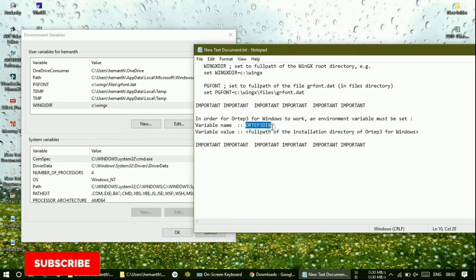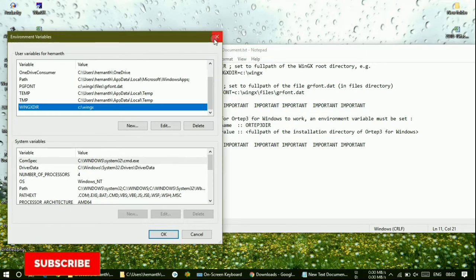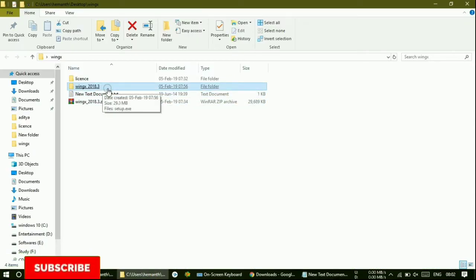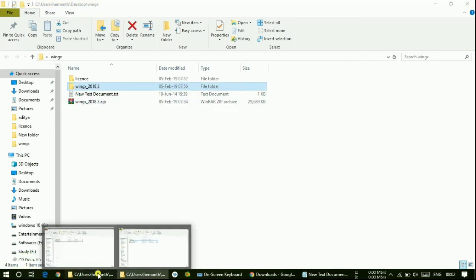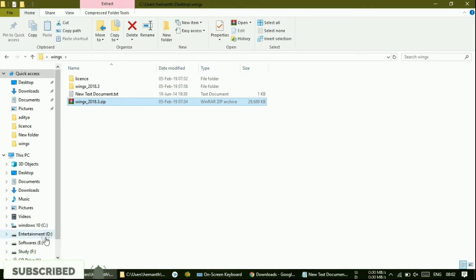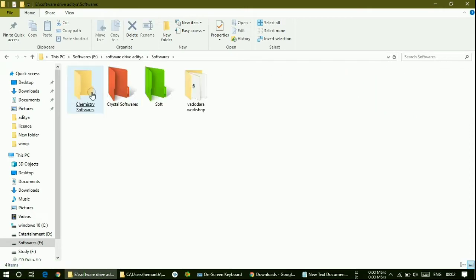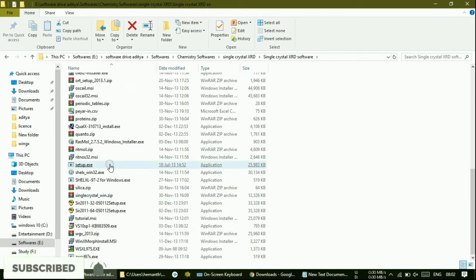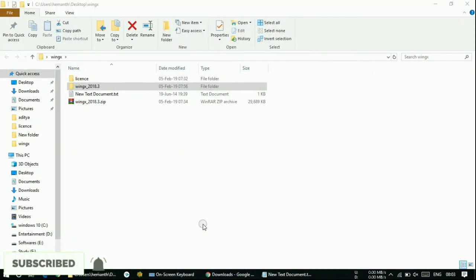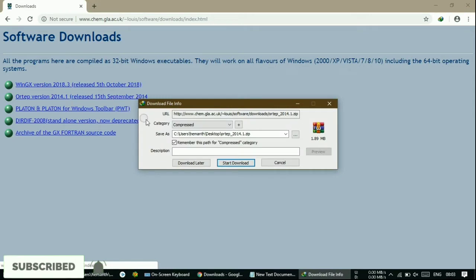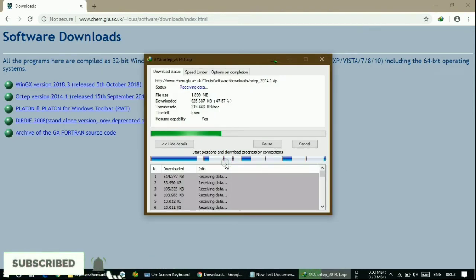Next, let me set for RTAP3 as well. If I want to use RTAP3, I need to set the directory for RTAP3 also. First, let me install RTAP3. Now I have set the WinGX directory variables. Let me now install RTAP3. From the website, you can download RTAP3 version 2014. I am just clicking onto this — it is just 1.89 MB. I am downloading it now.